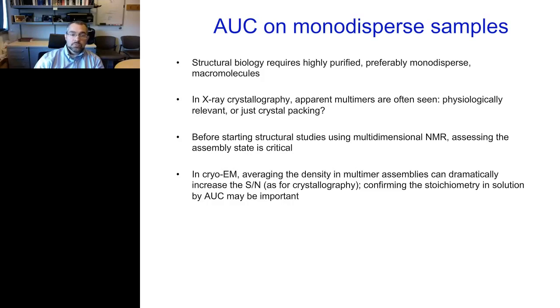Number two, this is a very common occurrence, that in crystallography you will often see what looks like a multimer in your structure.